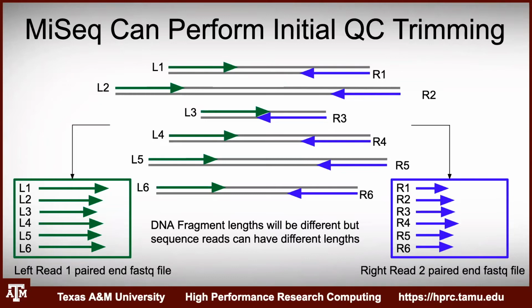What you see when you receive your essentially raw Illumina data also depends on how it was demultiplexed or treated coming off the machine. Some labs will do adapter trimming and things like that before they even send you the data. Some labs just send you raw data.